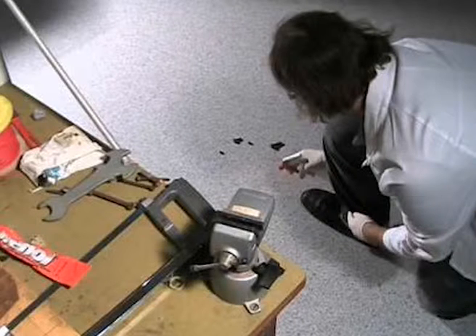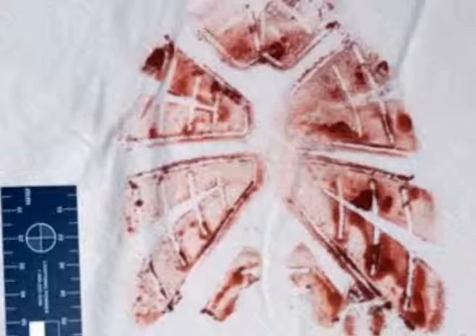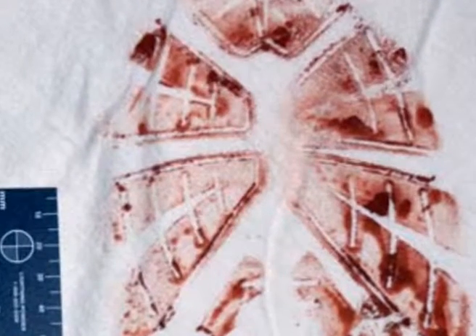There are a host of chemical techniques for detecting latent fingerprints on different surfaces such as iodine fuming, use of ninhydrin and its analogues, cyanoacrylate fuming technique, and many more. However, if the surface happens to be stained by blood, as is common at crime scenes such as in case of murders and assault, then special procedures have to be adopted to lift the prints. The main problem encountered with blood prints is that not every chemical reagent will react with the heme component found in blood to give the prints.